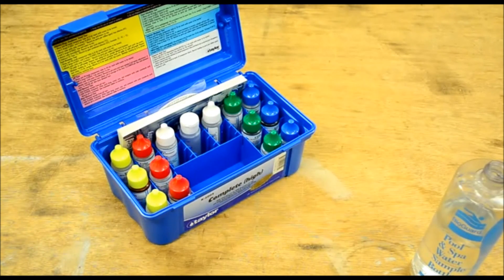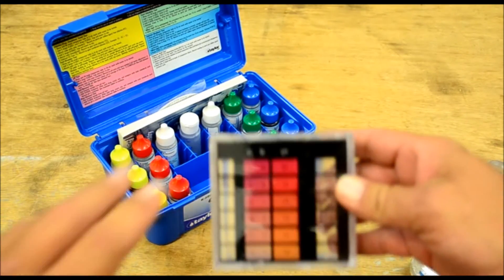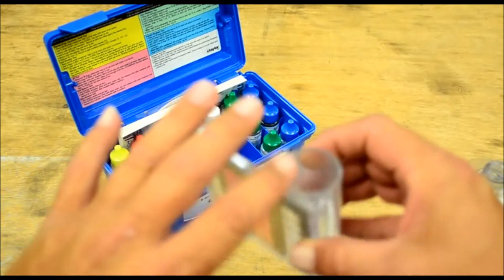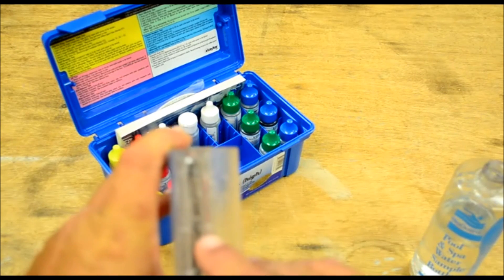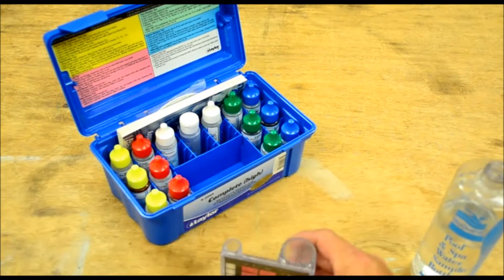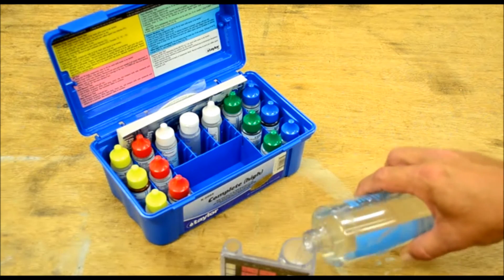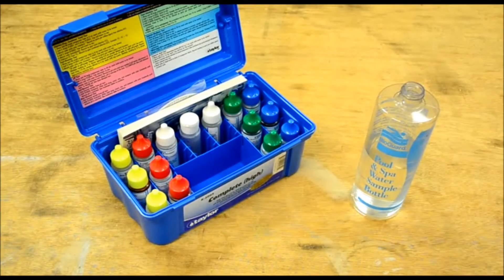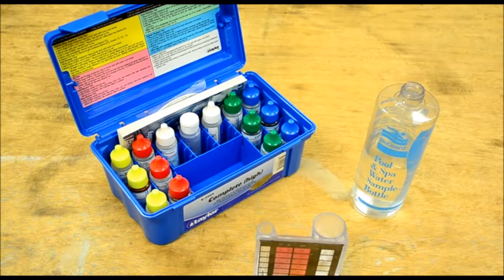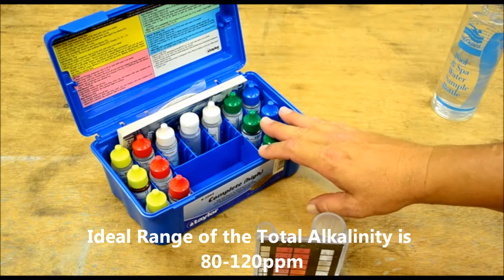All right, that's the total alkalinity test. We're going to get our large test vial — the same one we checked pH on. On the side you'll see a 25 milliliter mark; we're going to fill pool water to that mark. Make sure we've got it where it needs to be, then we'll get the reagents we need.